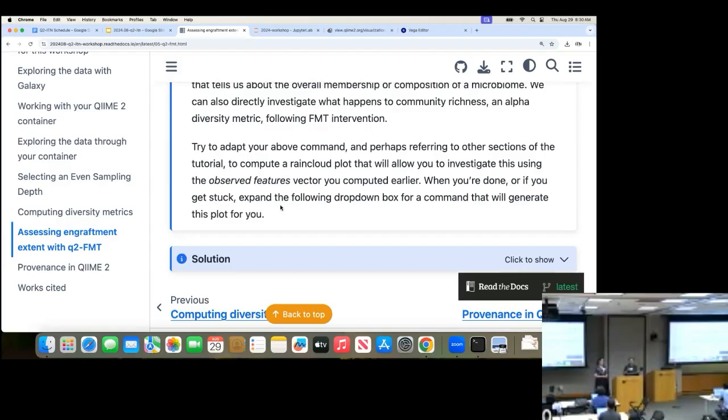So you'll just have to make some adaptations. This is a great thing to do over lunch, if you want to take a few minutes. Remember that --help parameter that might help you figure out what you want to provide as input here.